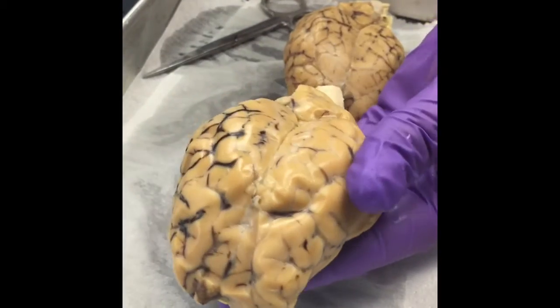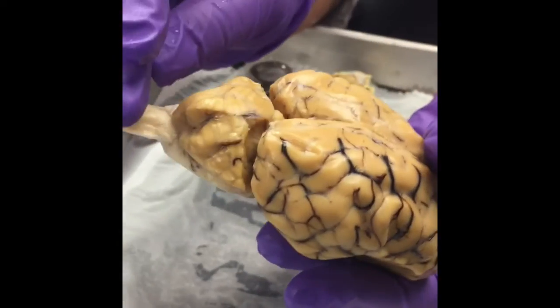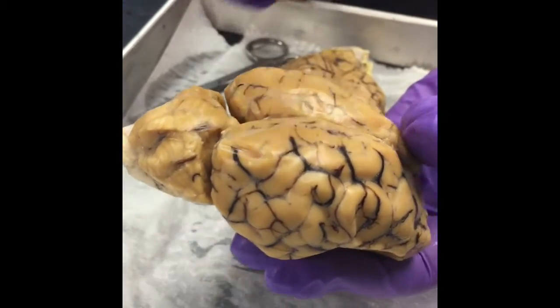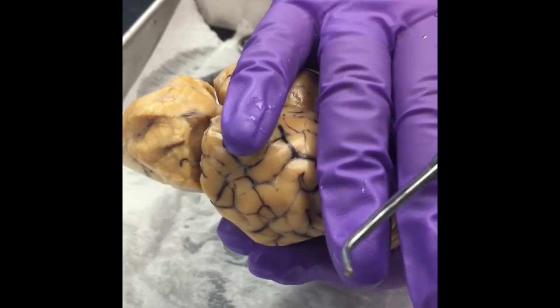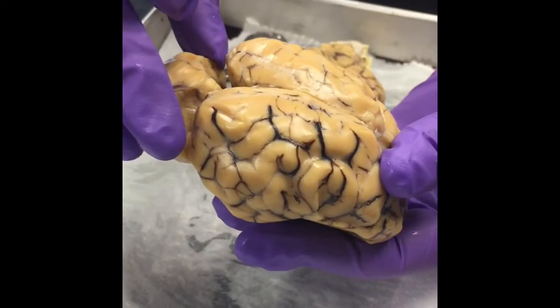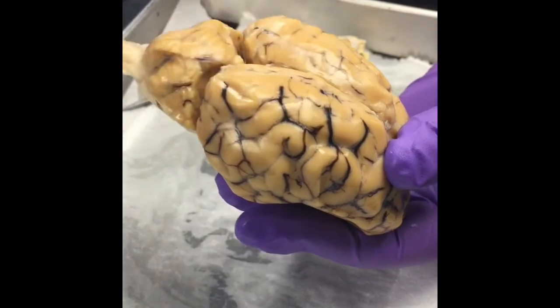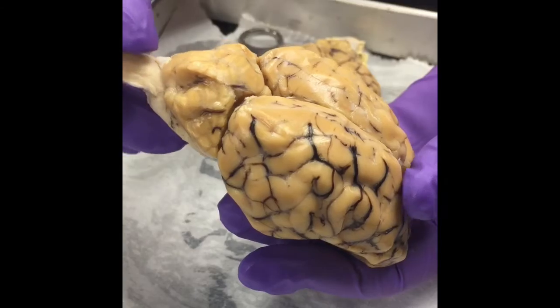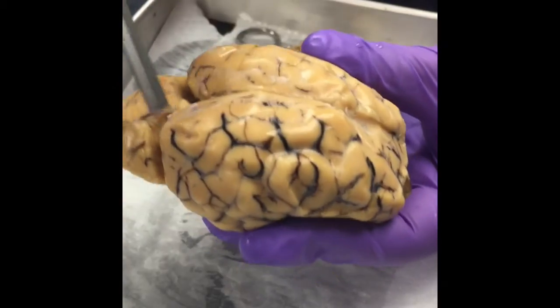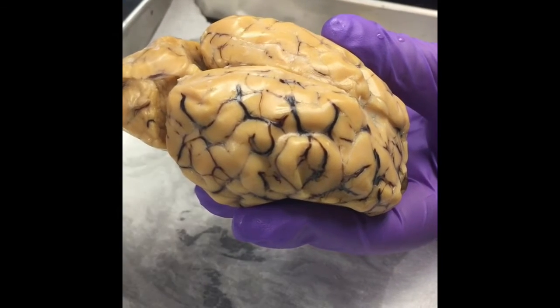What's that chunk on the back? Okay, so this piece on the back is the cerebellum. So this part's the cerebrum. So it's not part of the brain? It is. It's all part of the brain, but this part's the cerebrum. This is the cerebellum. Cerebellum literally means little cerebrum. Okay, it looks like a cauliflower. Almost. Why isn't that a lobe? Because the only part of the brain that has a lobe is the cerebrum. This has an entirely different makeup.